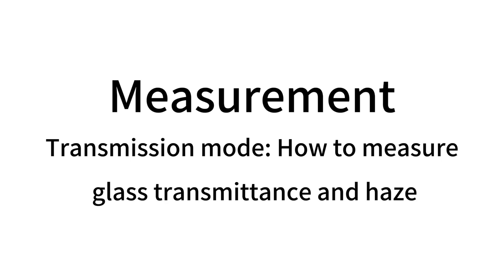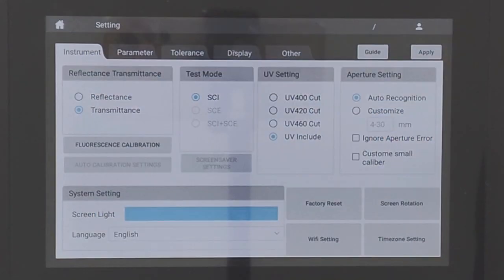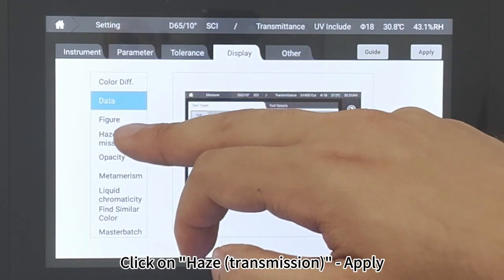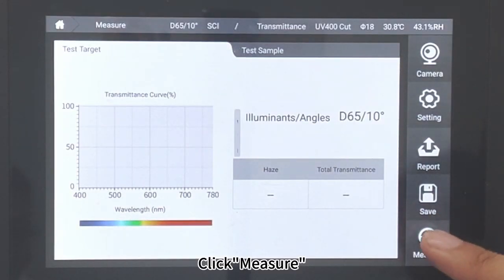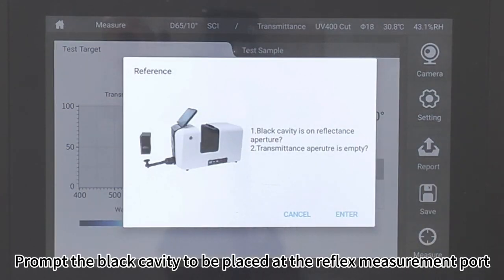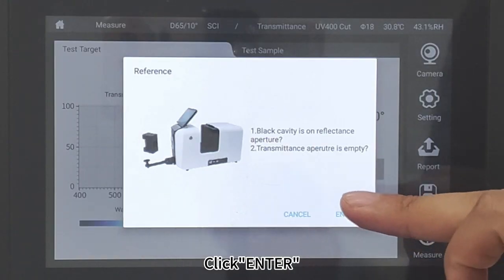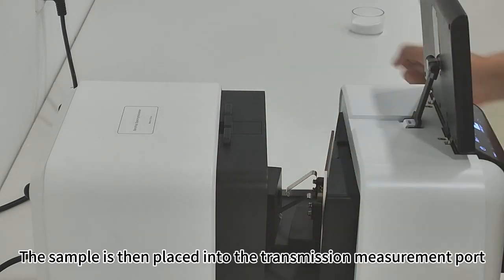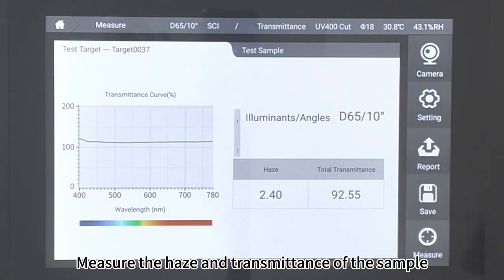Transmission Mode. How to measure glass transmittance and haze: Click Setting, then click Display. Click on Haze Transmission Apply. Click Measure. When prompted, place the black cavity at the reflex measurement port and click Enter. The sample is then placed into the transmission measurement port. Click Enter. The haze and transmittance of the sample are measured.